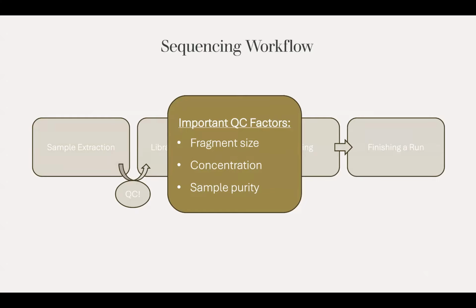Okay, so with that, let's talk about sample extraction. I've personally extracted from both tissue samples and plates of cells. I'll be brief, but I did want to give a few tips for each of these sample types.